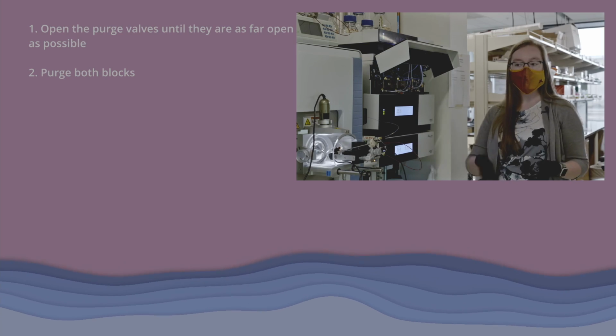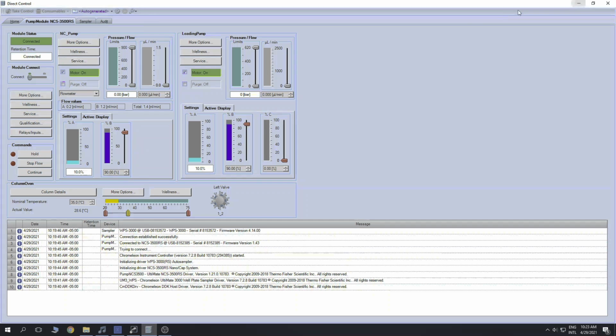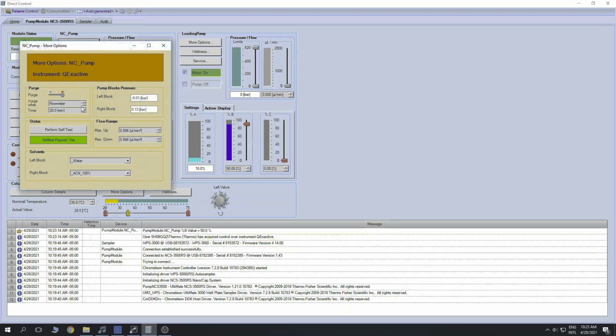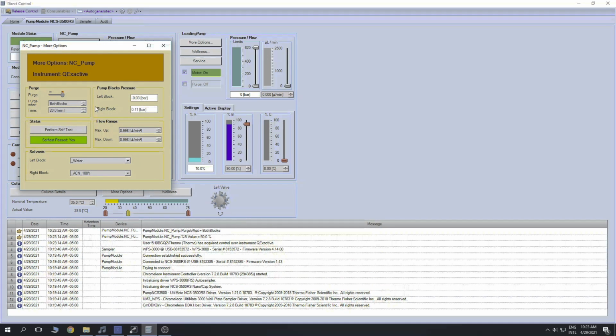Once you have your purge valves open, you'll go over to the instrument computer. Set your solvent composition for the nano pump to 50%, and under the More Options tab for the NC pump, you'll select to purge both blocks, and you want to do this for 20 minutes.